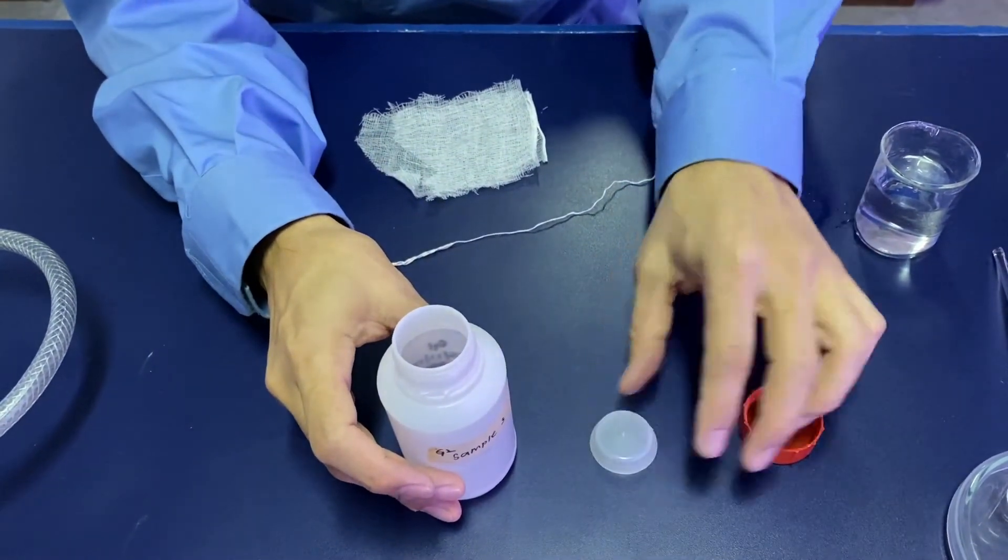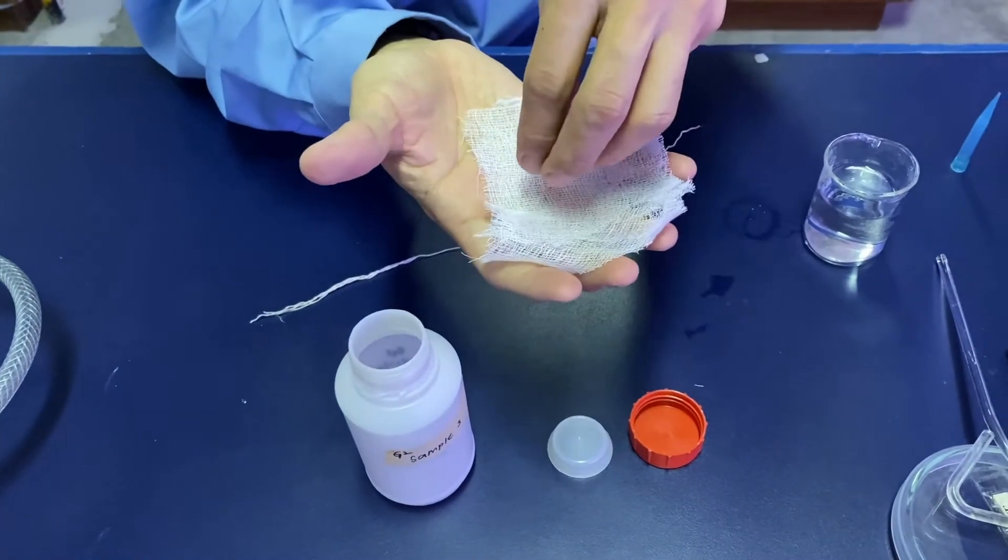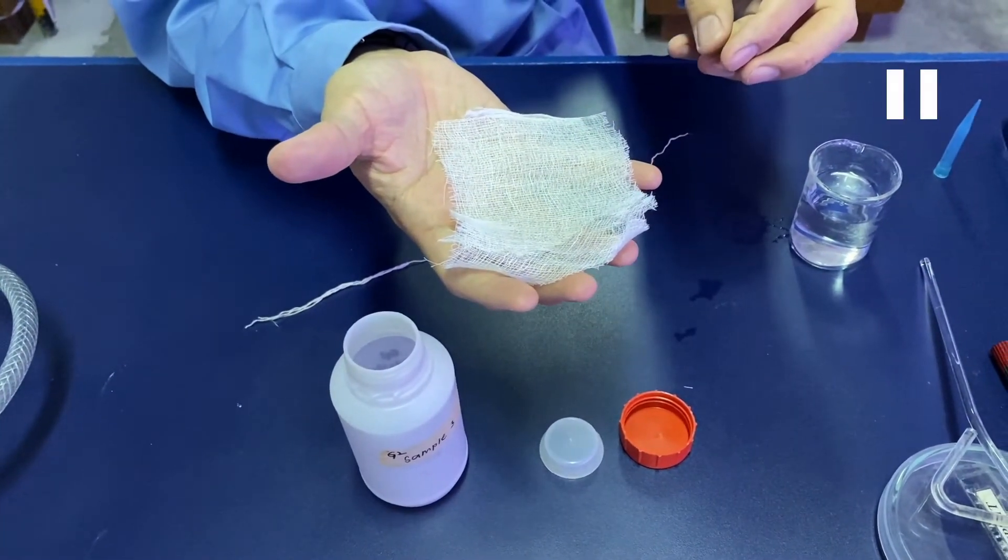The bottle has a cap and a screw cap. This is the gauze where you place the soil on top.